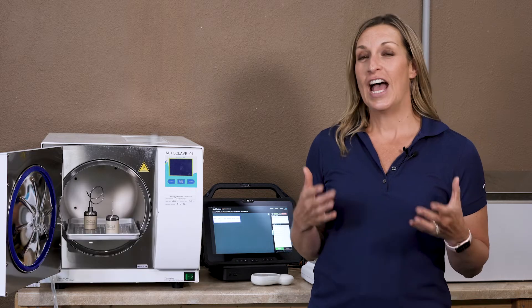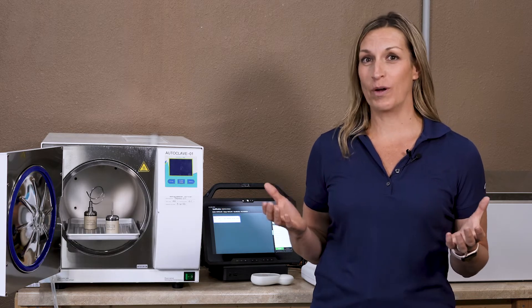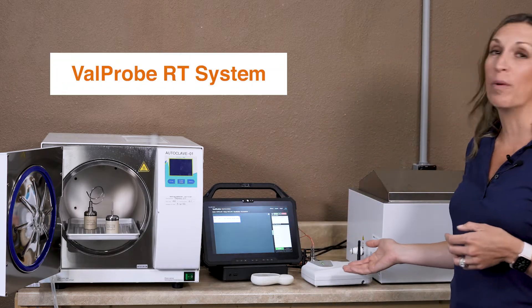Since I showed you the validation console with our Validator AVS, I'm now going to show you a little bit on how it works with our Valprobe RT system.